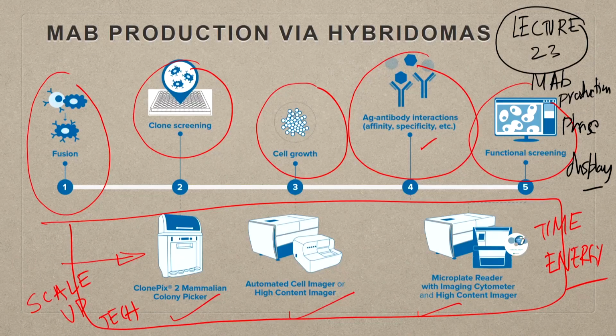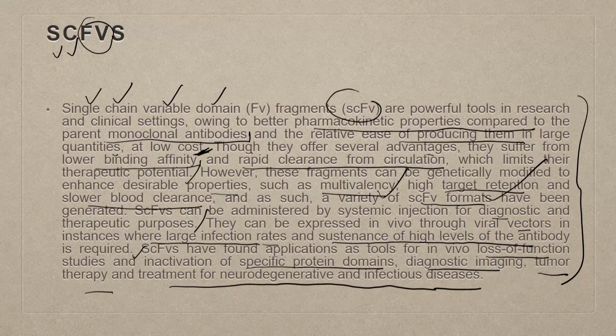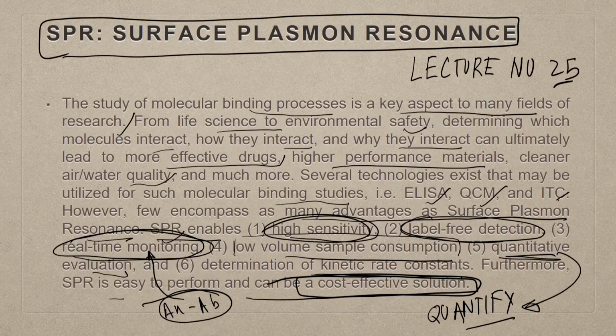So, you have to realize that for any biosensor, whatever you wish to develop, whatever areas you want to devote to, one of the challenges is always the noise, the signal to noise ratio, and cutting down on the noise is not an easy job. It takes a hell of an effort. So, in that context, if we talk about SPR as a technology, it is one of the very profoundly superb technologies in terms of its specificity and in terms of its binding interaction.